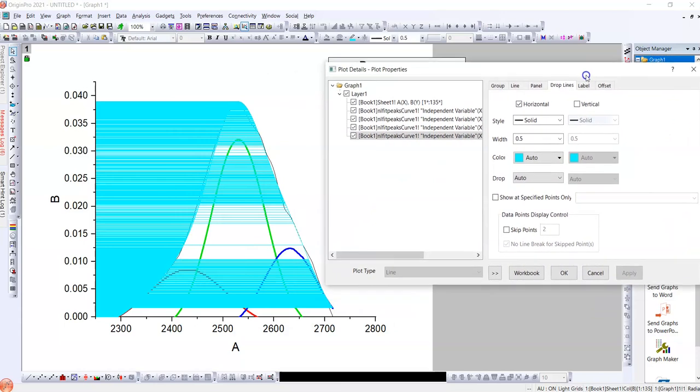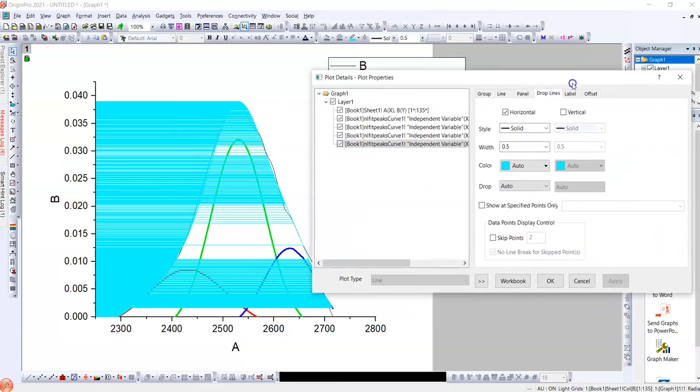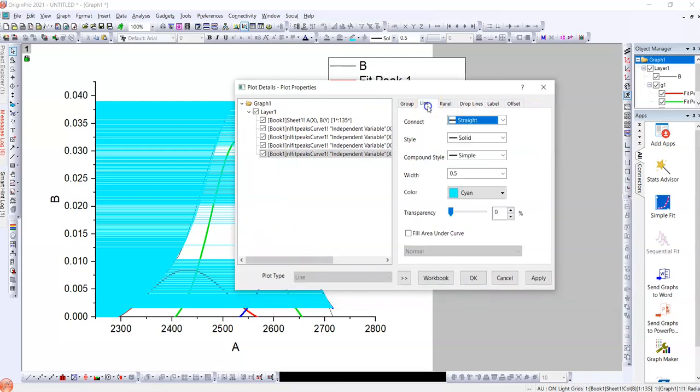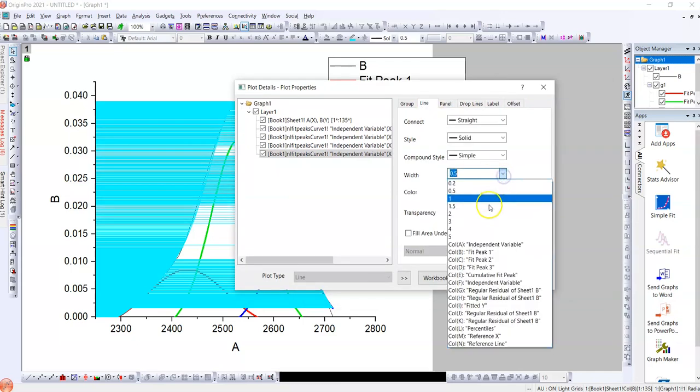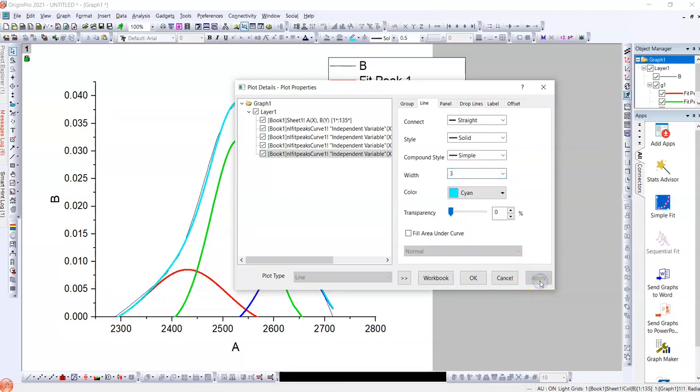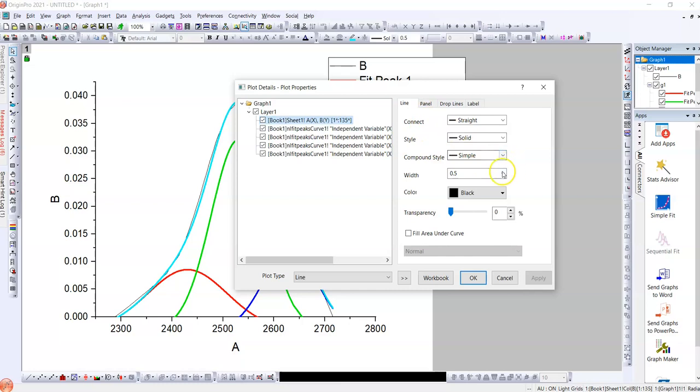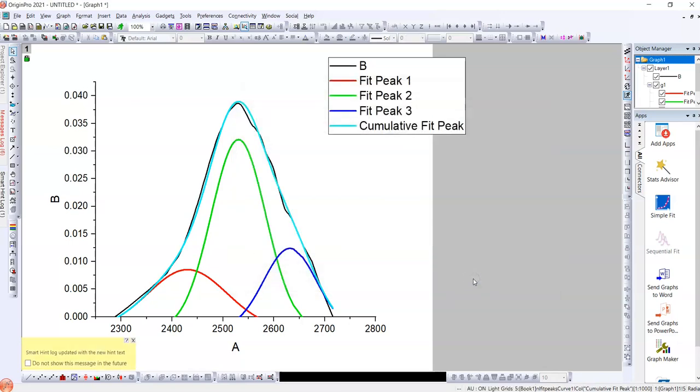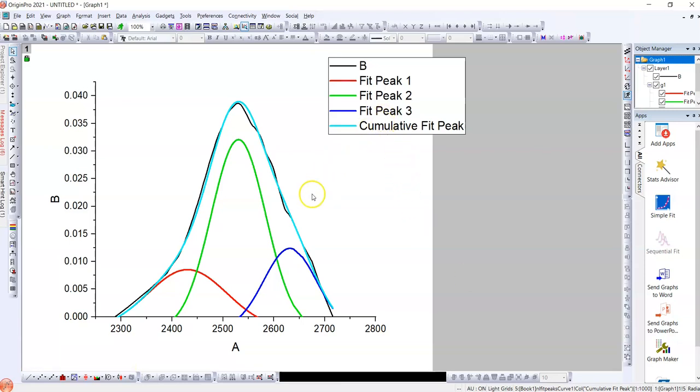And line, if I get line, I just enhance the width of the line. And for our main data. This end up. Black one is our original FTIR data. And cyan one is the fitted cumulative curve. And the assembled curve came up as the red one, green one, and the blue one.